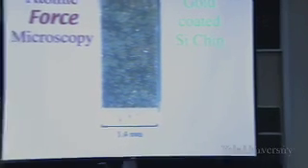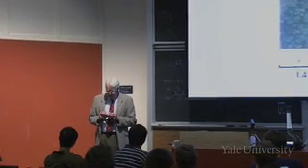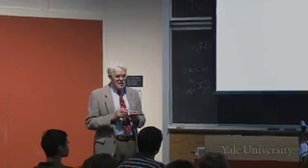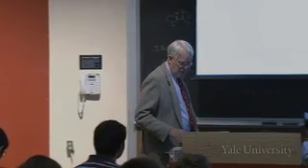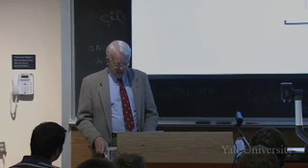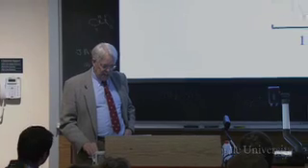in this little bug box. You can't see it here. Well, there's the chip in the middle, right? And I'll pass it around so you can look at it. And if you tilt it so that the light from the ceiling glints off the gold, and you see it really shiny, you may be able to see at the thin end these little V's. Okay? You can see here at the bottom little V's. The chip is 1.4 millimeters wide. It's a gold-coated silicon chip.